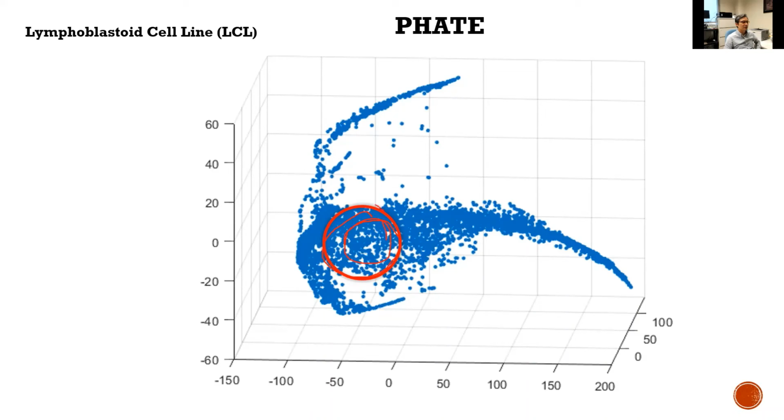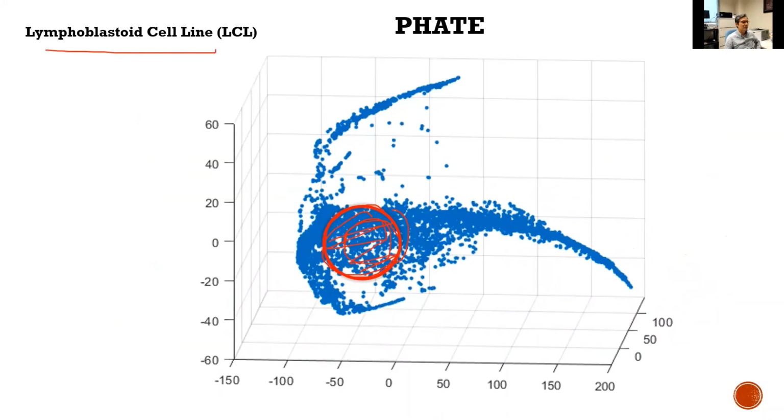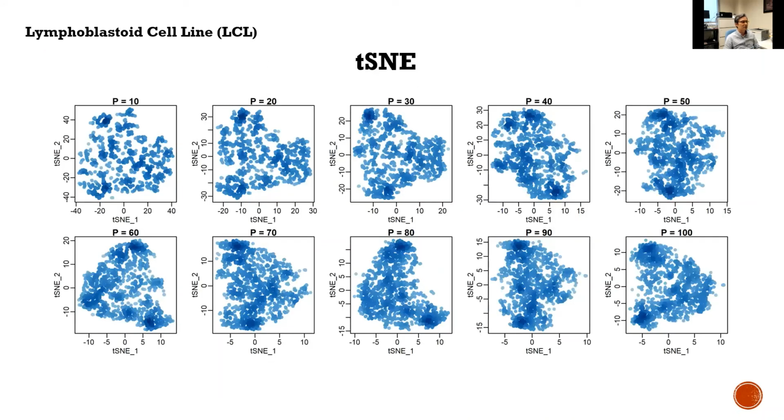They are all G1 phase cells from the same cell line, so they should be a highly homogeneous population, and we keep those cells for downstream analysis. Then you use tSNE to visualize this, and no matter what parameter you use, you always have a cloud of cells very similar to each other, which confirms our selection of the cells.